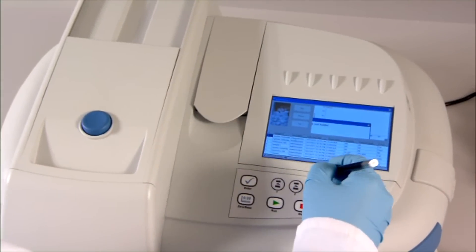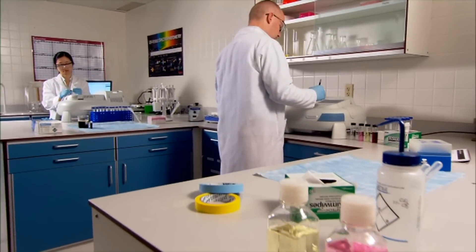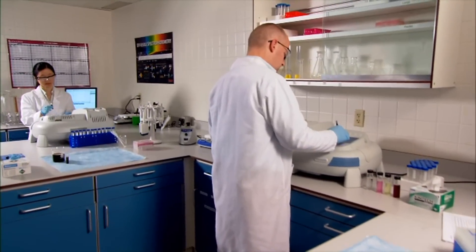That means improved integrity of results, user after user, time after time. The Thermo Scientific Evolution 200 series and Q software.